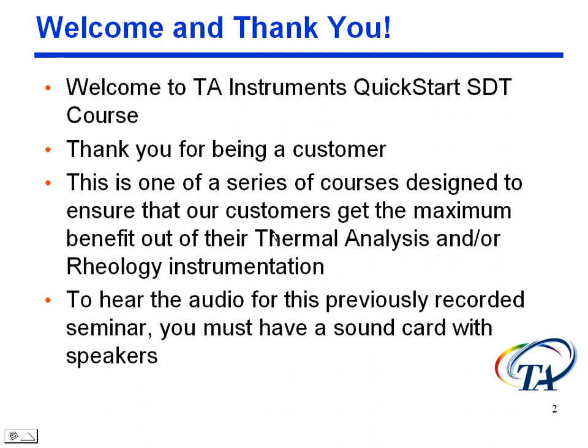Now, this is a pre-recorded course, so if you hear the audio for this course, you must have a sound card with speakers installed. There's also another couple things that are different about this pre-recorded course. You can't ask questions as we go through, obviously, because there's not an instructor live here. But what you can do is write down the slide number and email us questions. And there'll be an address at the end of the presentation that you can email that to.